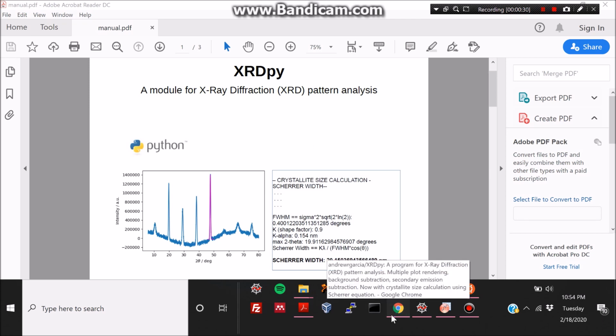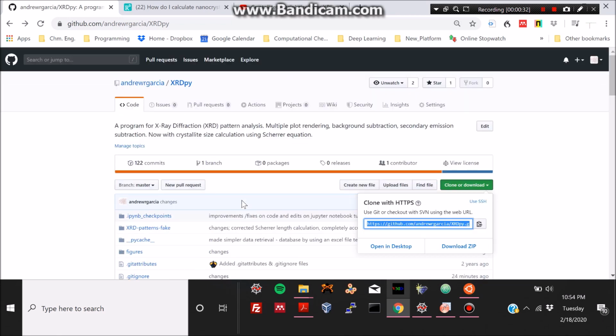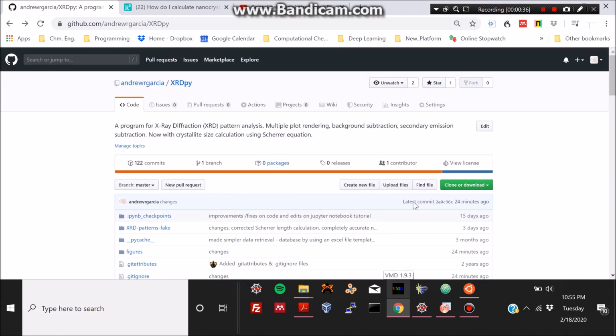I'm going to jump to our repository, which houses all of these scripts. The repository is the module, and when you're going to start it, that's the first step. Then you may fork it if you want to make changes and collaborate, or maybe give me some feedback on the code. Then you click on that, and the next step would be to clone.